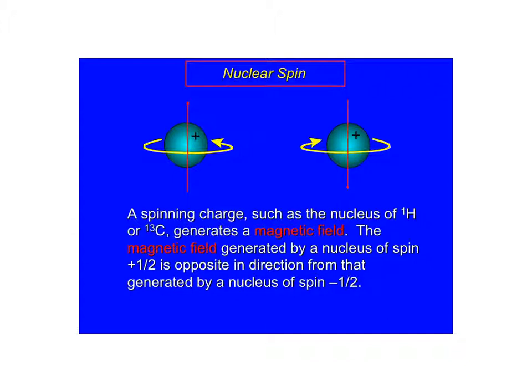It's just that normally, whenever you have a beaker full of carbon-13 or protons around, they're all going to be averaged out because these are vectors. If you think back to physics.